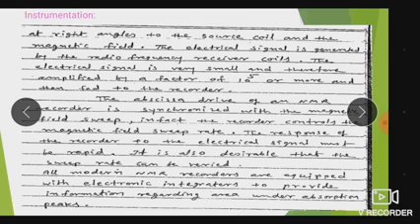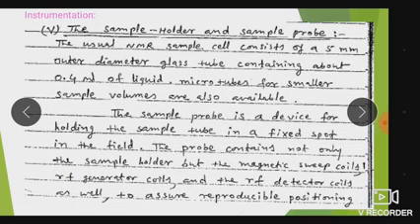The response of the recorder to the electrical signal must be rapid, and it is also desirable that the sweep rate can be varied. So all the modern NMR recorders are equipped with electronic integrators to provide information regarding the area under the absorption peak. So what is the use of this? It provides the area under the absorption peak.